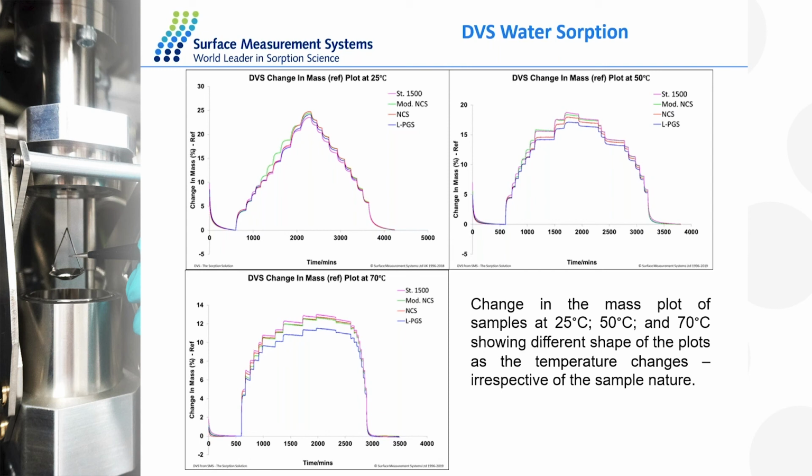Okay, I hope that answers, Ilham. Another question from Raksit. Hi, Sabiyah. Thanks for your presentation. Why do different kinds of starches not show any difference in moisture uptake even at different temperatures? Does it mean they all behave the same? In your previous slide, Starch 1500 has shown some difference compared to other starches. Can you please explain?